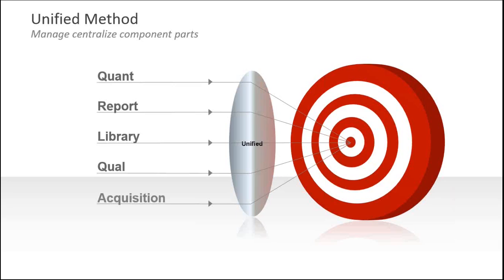And those component parts are stored together in what is traditionally called the .m. The beauty of this is that you can mix and match parts of the method together to form another derived method. That's what is labeled the unified method.